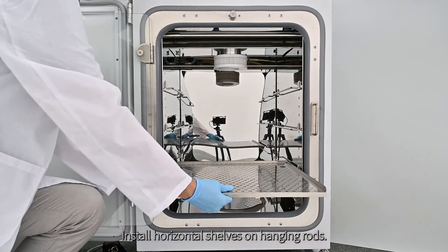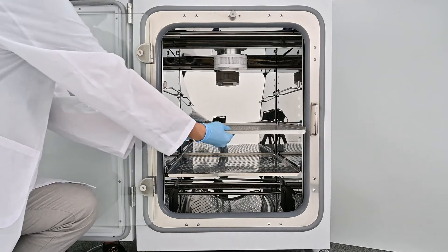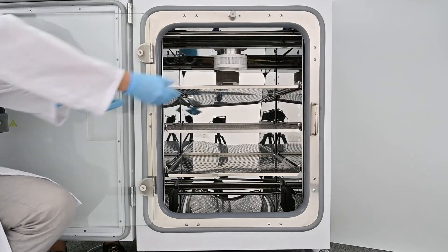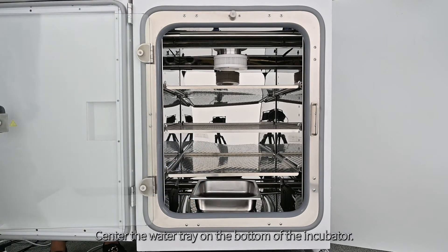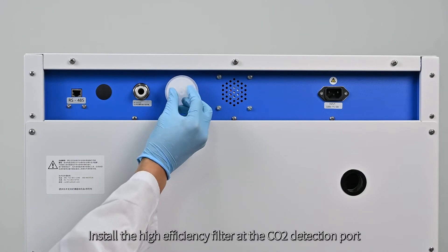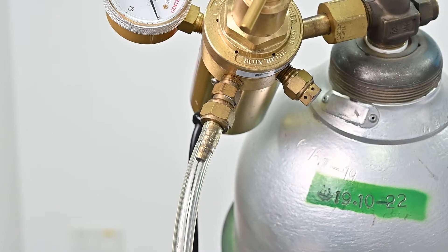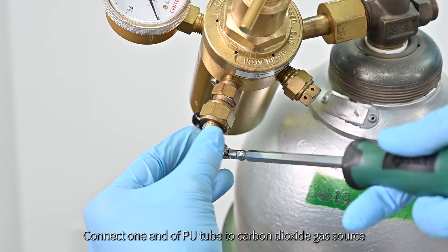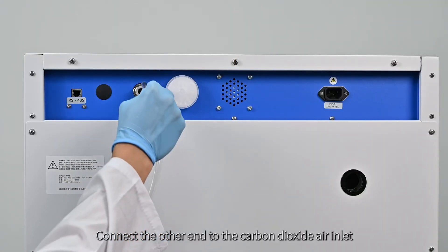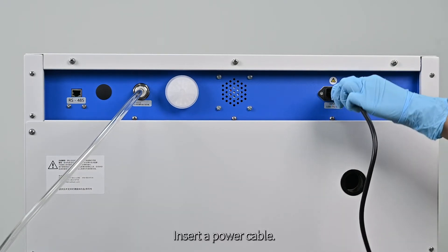Install horizontal shelves on hanging rods. Center the water tray on the bottom of the incubator. Install the high-efficiency filter at the CO2 detection port at the back of the incubator. Connect one end of the PU tube to the carbon dioxide gas source and secure with clamp. Connect the other end to the carbon dioxide air inlet at the back of the instrument. Insert the power cable.